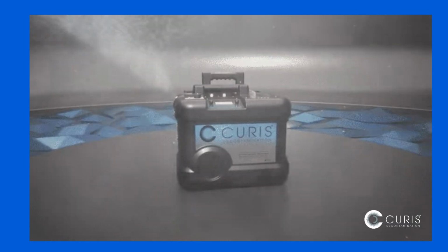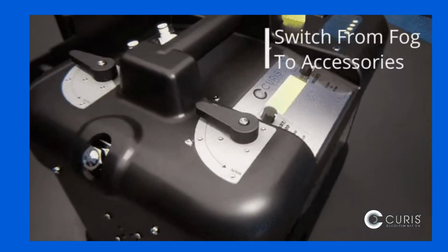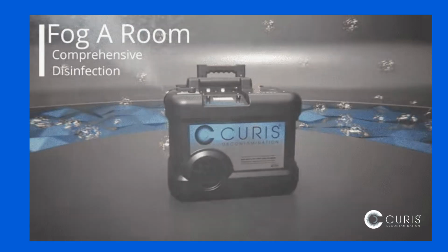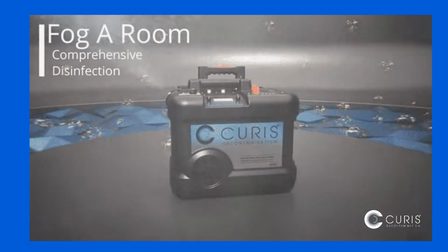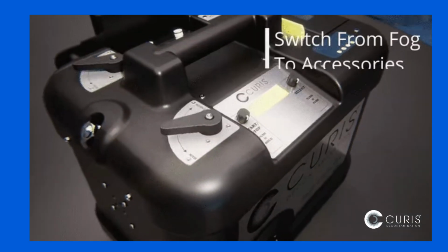Lab disinfection is more than a task, it's a culture. When labs understand the difference between sterilization, disinfection, and sanitization, and combine the right tools, training, and technology, they reduce risk, improve consistency, and protect the integrity of everything they produce. A safer, cleaner lab starts with informed decisions. And those decisions are what make scientific progress possible.